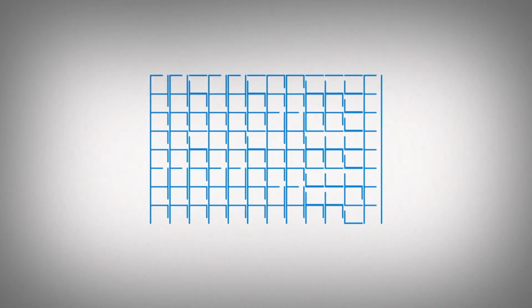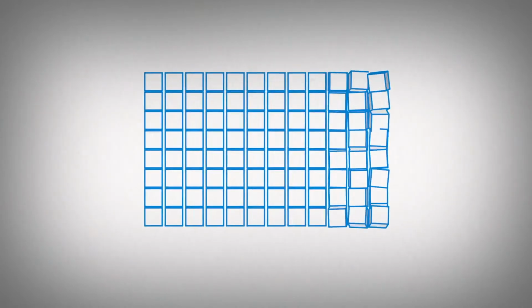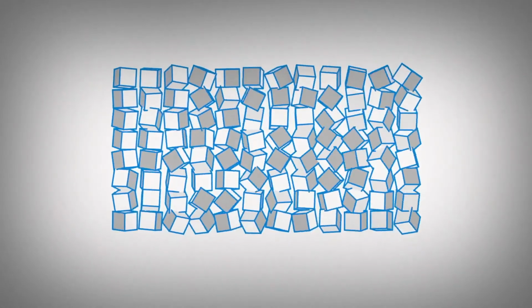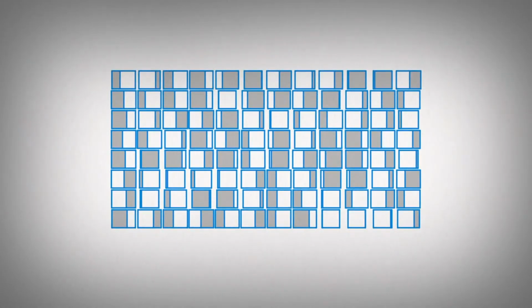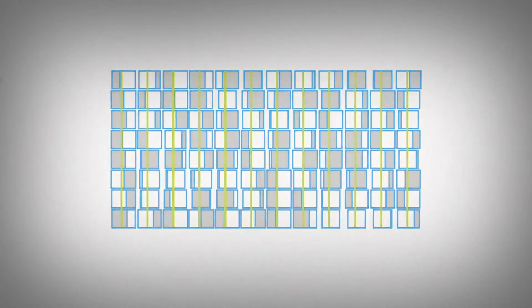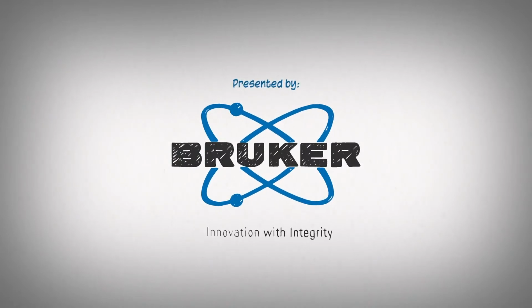Texture is important in optimizing both mechanical and electrical properties of materials. A random texture tends to resist brittle failure, as it is difficult for cracks to transfer from one crystallite to the next. On the other hand, the properties of a material, whether electrical or mechanical, are optimal in one crystallographic direction, allowing components to be pushed to new limits. Understanding the orientation of a material and the effects of processing steps on that orientation is important to unlocking its full potential.